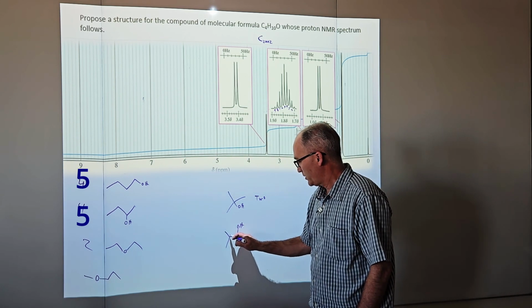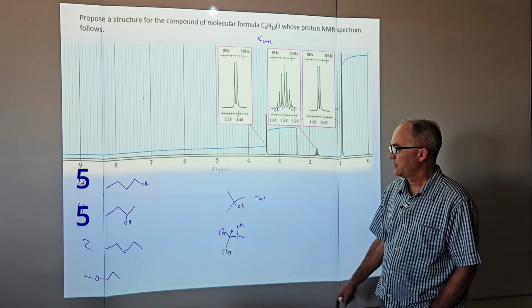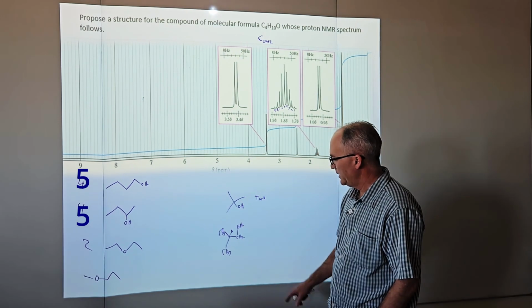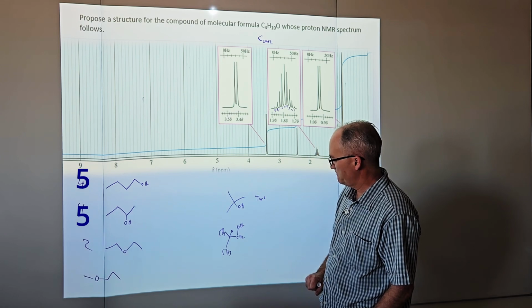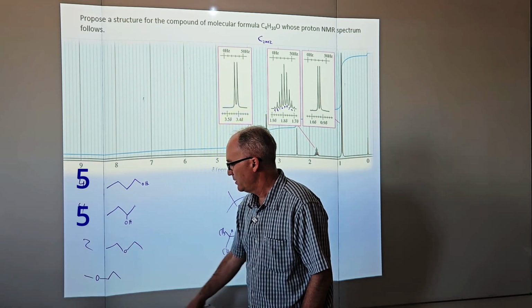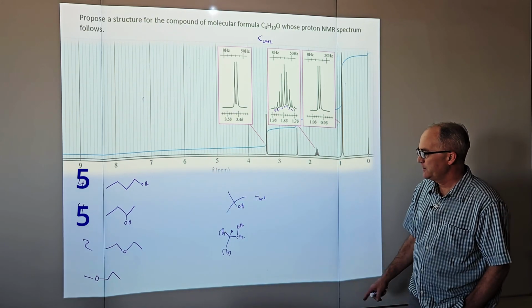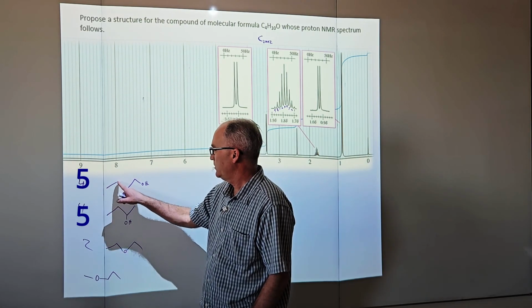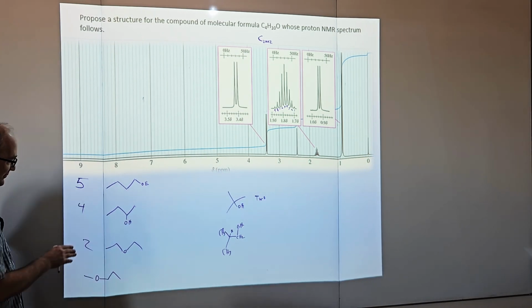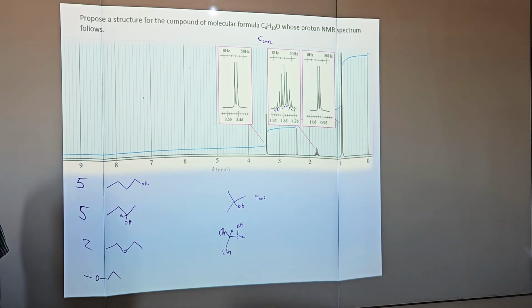Now look at this thing. 1, 2, 3, 4. All right, so this is t-butyl alcohol, isobutyl alcohol, 1-butanol, 2-butanol, diethyl ether, methyl propyl ether. I might have everything I need. 1, 2, 3, 4. Thank you so much, Jonathan. 1, 2, 3. Yeah, don't screw up your number of signals.